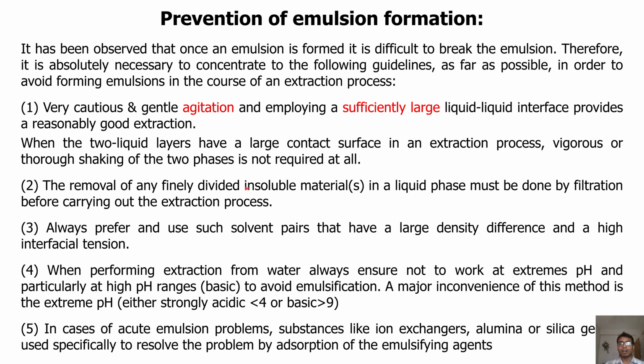Number two, the removal of any finely divided insoluble materials in a liquid phase must be done by filtration before carrying out the extraction process. Number three, always prefer and use such solvent pairs that have large density difference and have high interfacial tension. I have already discussed this: if you have similar density of solvents, then obviously they may form some emulsions.